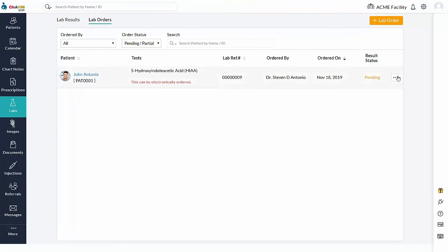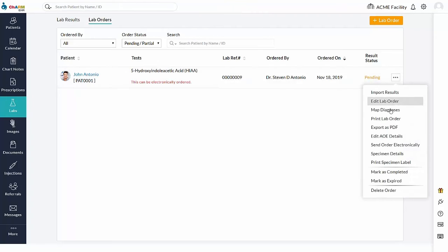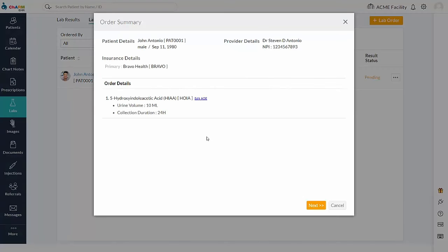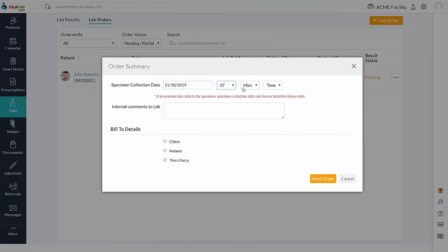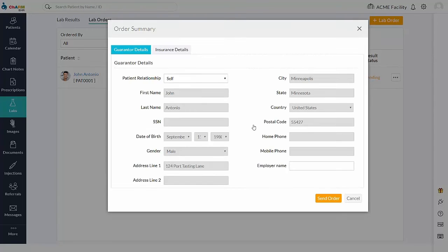Click Send Order Electronically action item. This will open up the order summary page. Enter the specimen, collection, date, and time. Select the bill type based on the client and then place the lab order.